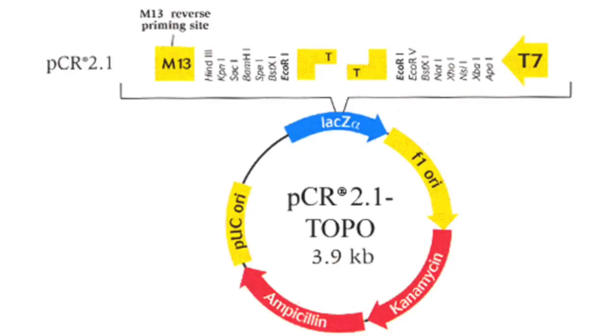The ligation reaction was carried out using the vector PCR 2.1 TOPO, which is linearized with topoisomerase 1 and ready to ligate PCR products. The PCR product was previously amplified with Taq polymerase, so the DNA sequences were left with 3' overhangs compatible with the TOPO linearized plasmid that has 3' T overhangs.